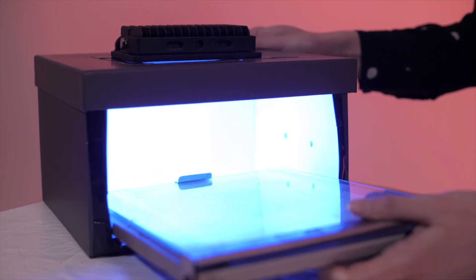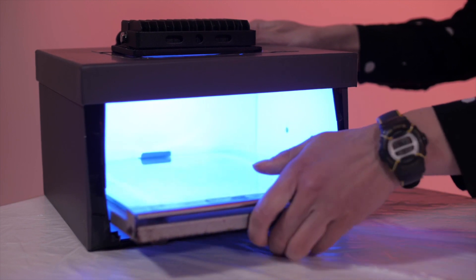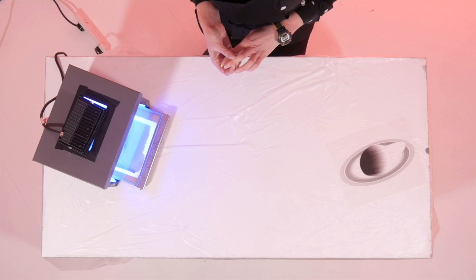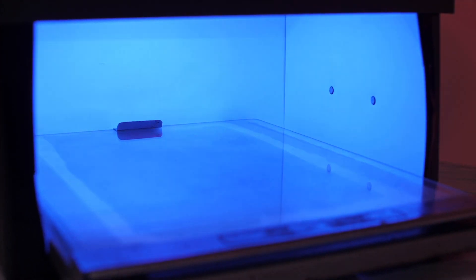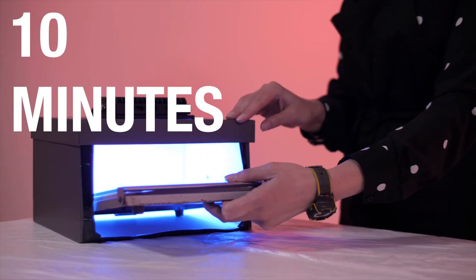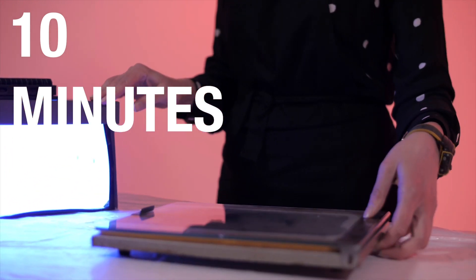I will put the frame inside the box for 10 minutes. The UV light will then darken the paper to a dark browny rust colour. Be careful not to look at the UV light for too long as it can damage your eyes. After 10 minutes you can take your frame out and turn the UV box off.